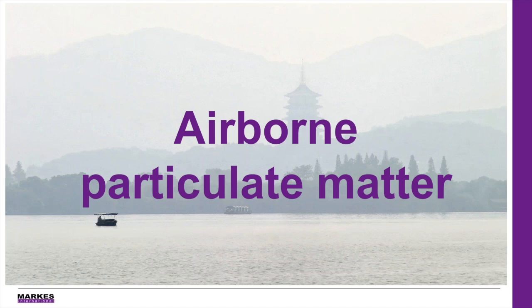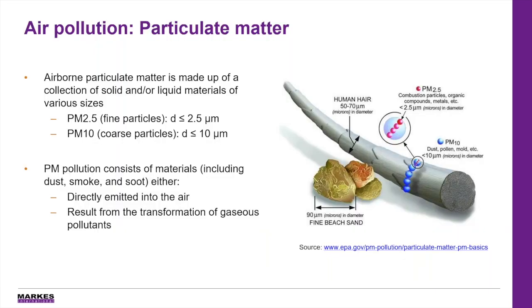So now we're going to move from VVOCs all the way down to SVOCs, and we're going to have a look at airborne particulate matter analysis by thermal desorption GCMS. So airborne particulate matter is made up of a collection of solid and or liquid materials of various sizes. So you've got PM2.5 and PM10.